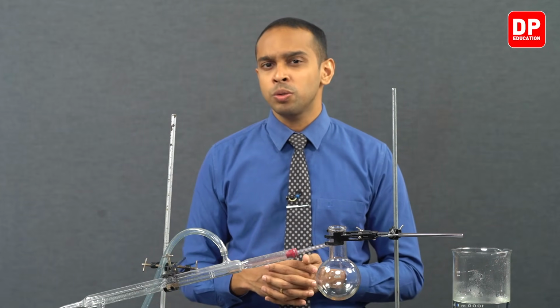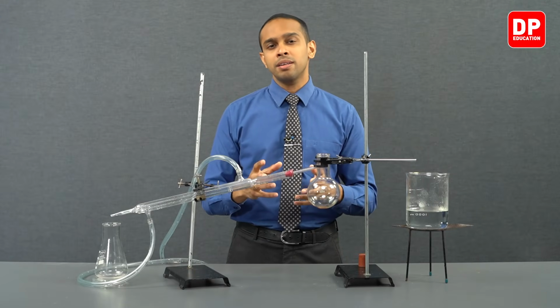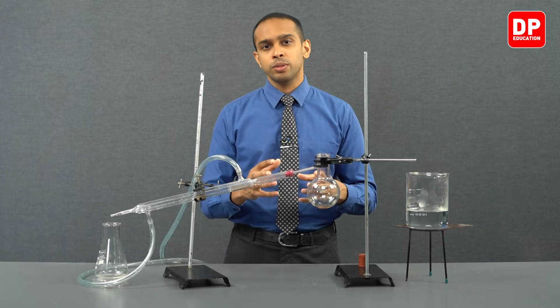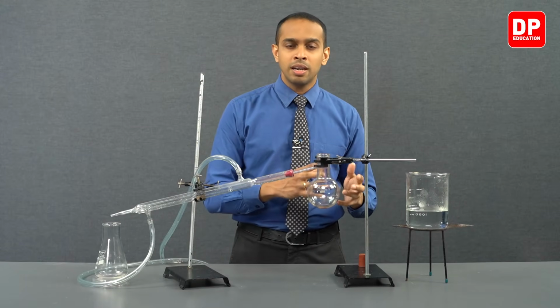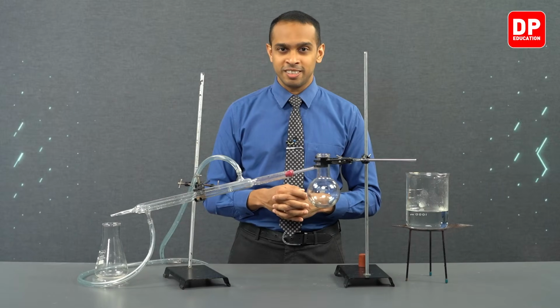Now we can move on to a small additional part to explain how the dehydration process was done with the use of anhydrous sodium sulfate. Now students, let's observe how sodium sulfate will appear if traces of water were actually present in a given sample where water was not supposed to be found.